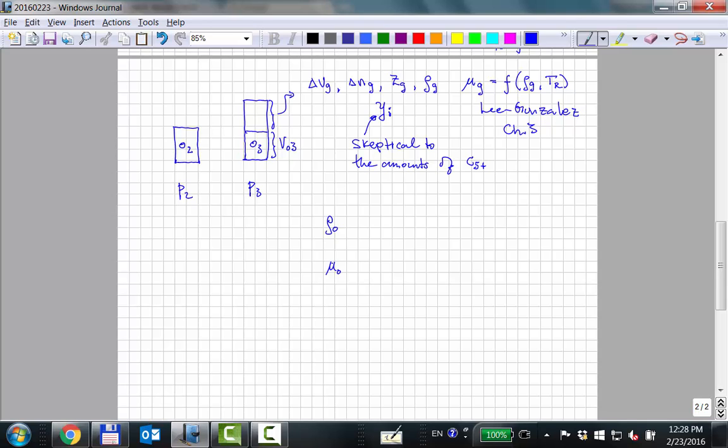The oil density is calculated, by kind of a material balance. I'll show you how that's done. We know the gas that we took away, so we know the mass that was taken away, and we do a material balance of all the gases. I'll show you how we get that a little bit later, because we have to complete the entire experiment before we can do that calculation.